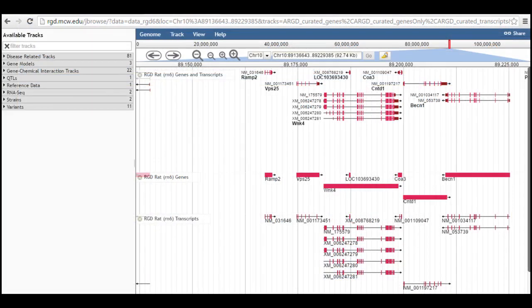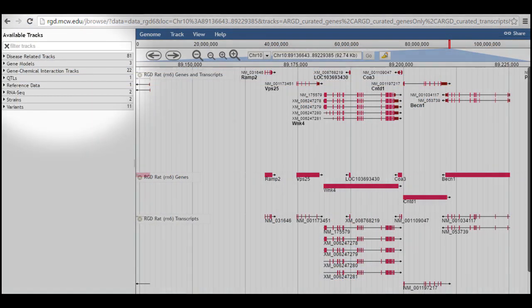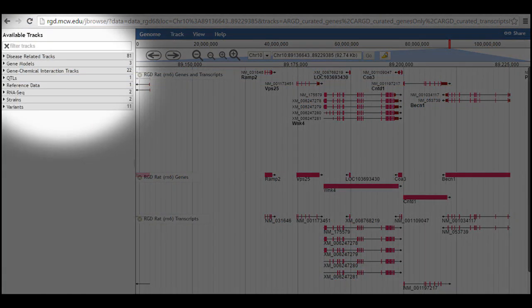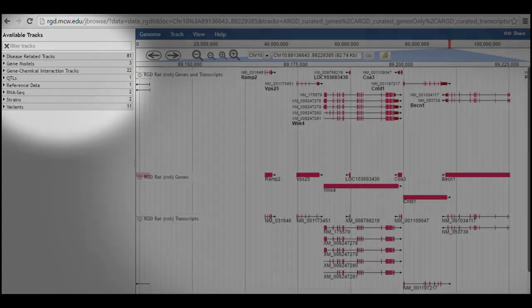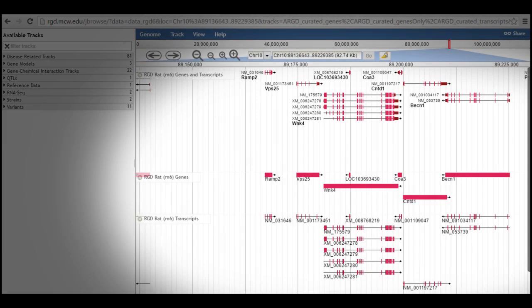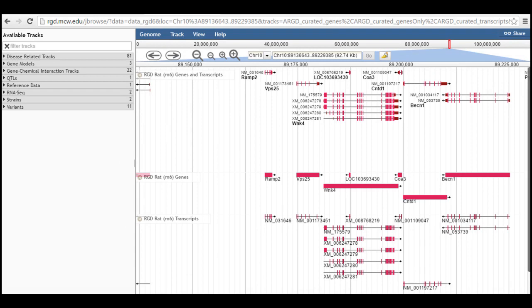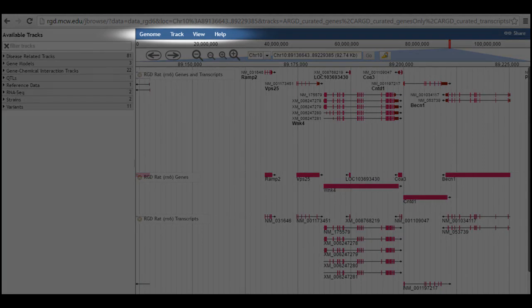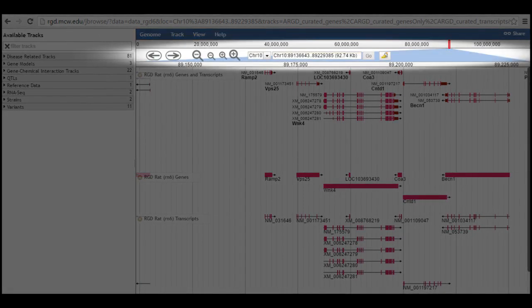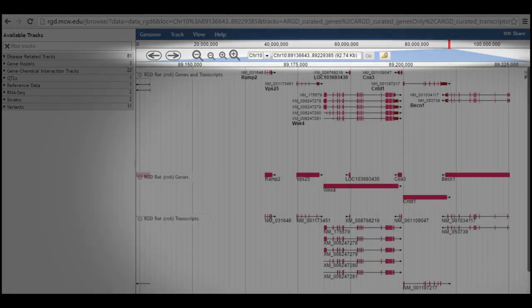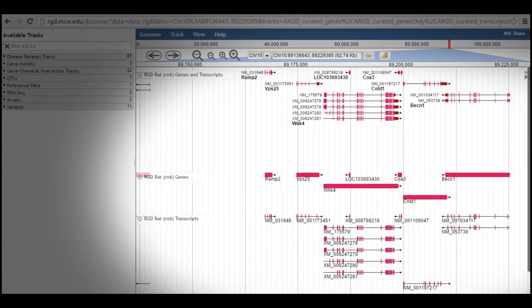The JBrowse page has two major sections: the available tracks menu on the left side of the page and the browser itself on the right. The browser has three sections: the blue menu bar at the top, the navigation tools below that, and the tracks data display at the bottom occupying most of the window.